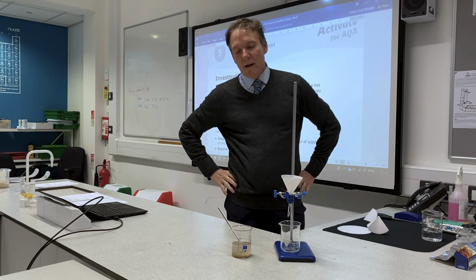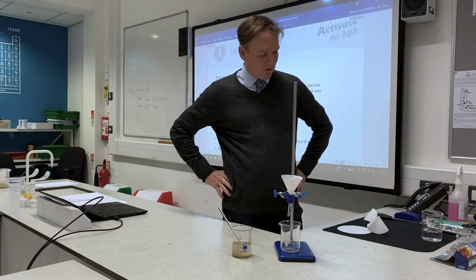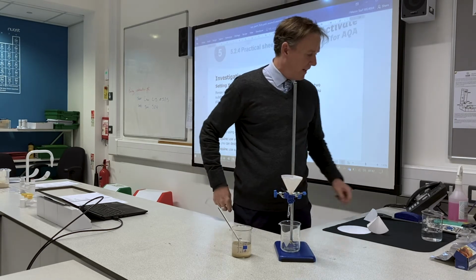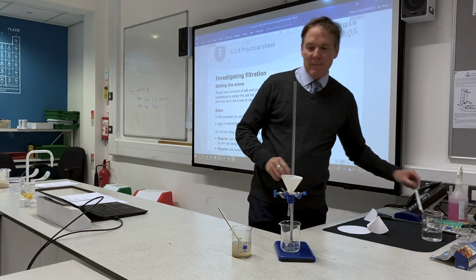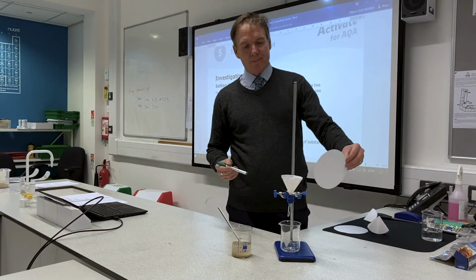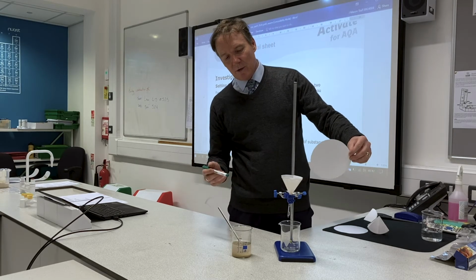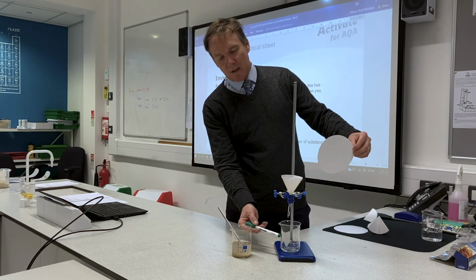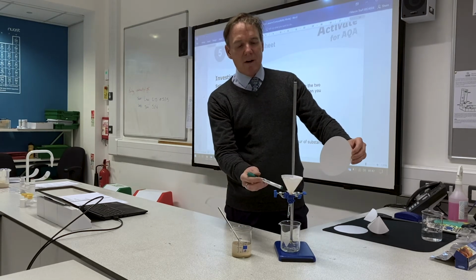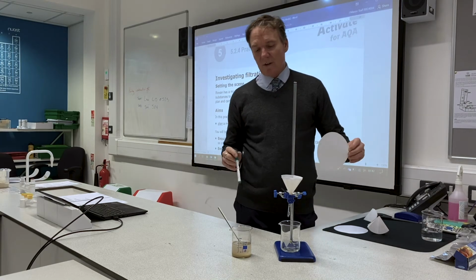All right, here are some key terms about filtration. So we've had our filter funnel, which you can see is on there. We have our filter paper, which I've folded up and put into the filter funnel. We have our beaker, which is collecting the liquid. We have our clamp stand there.